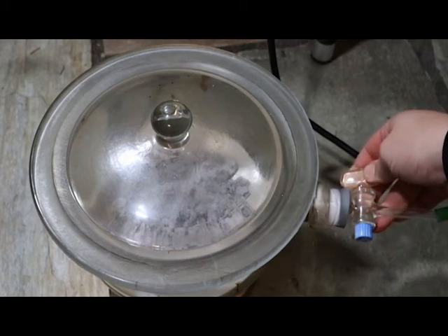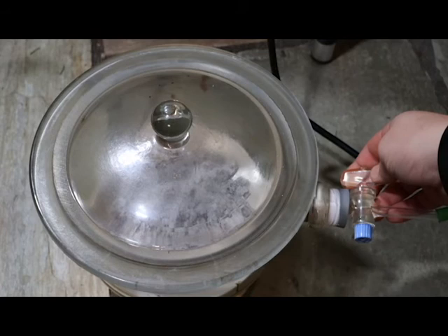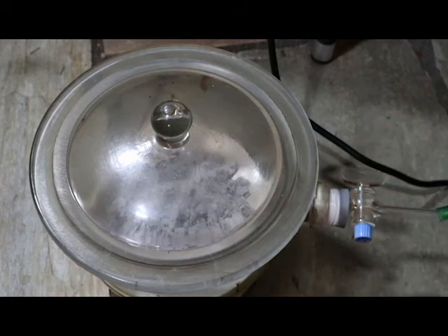After we suck dry our oxalic acid on the pump for a few minutes, we transferred it on a plate and put it in the vacuum desiccator. We then slowly pulled the vacuum to dry it faster, but you could probably also use a normal desiccator, especially when using dichloromethane for the washings, as it's very low boiling. Or you could also probably just heat it on the radiator until it's dry.